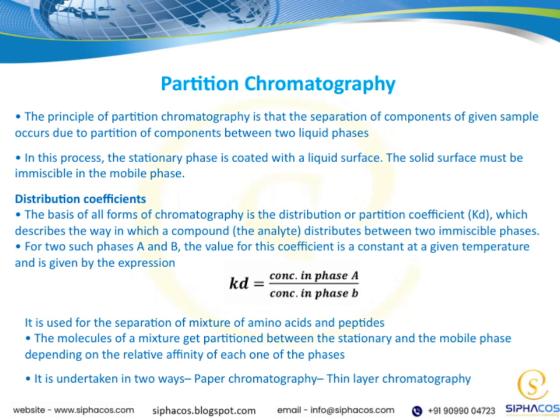So overall, the effectiveness of chromatography hinges on these principles: how molecules partition between phases and how their distribution coefficients influence their movement. And this understanding allows us to separate complex mixtures like amino acids and peptides efficiently.